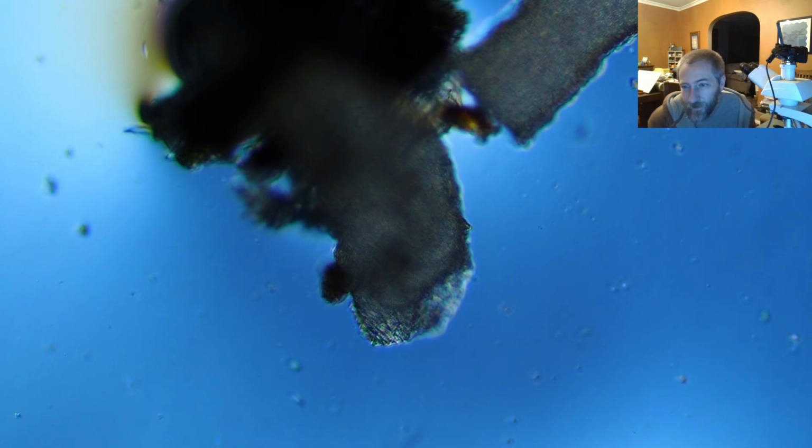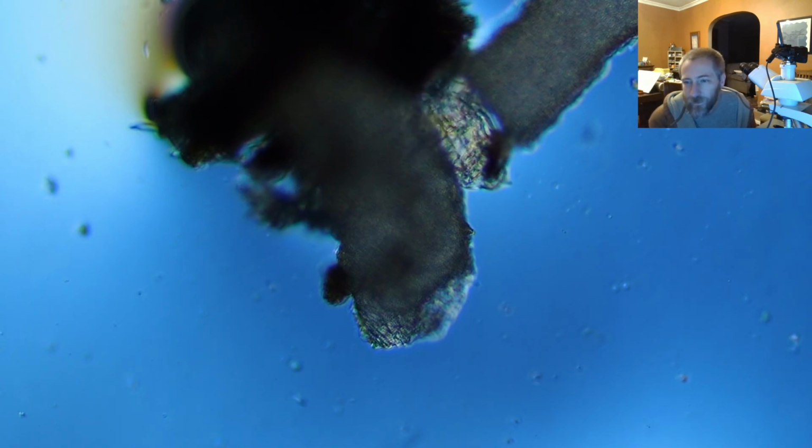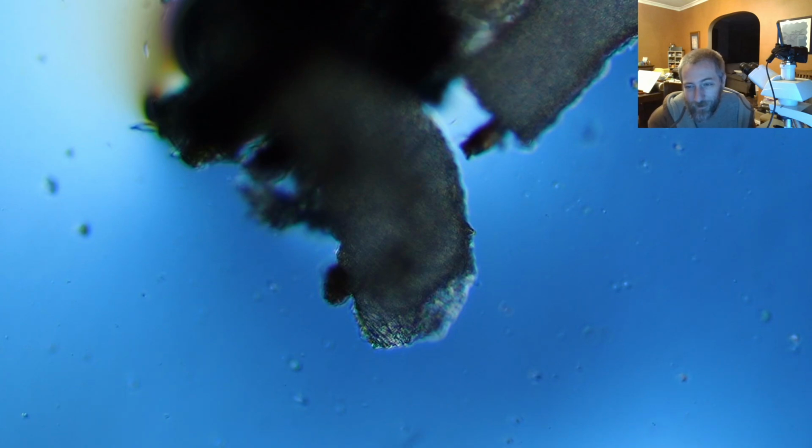Yeah, I use the SEM to search for hearing sensors, though. I don't know how you tell what's a hearing sensor. It's hard to tell sometimes. You want a drawing of an SEM? I mean, they just look like a computer mostly, but I can do it. It might not be the greatest sketch.